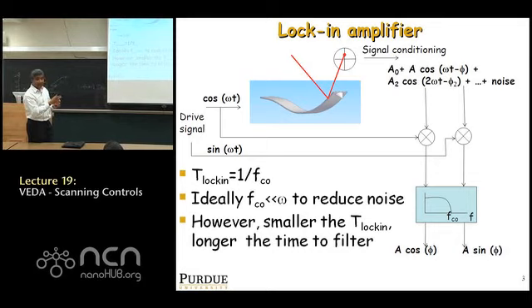I encourage you, in fact, to find out on your own AFMs how you would adjust the lock-in time constant in your AFM. Does it allow you to do it? I guarantee you it does. But you may need to send emails to tech support to find out, okay? But I'm happy to tell you, at least on some of the systems, how to do it.